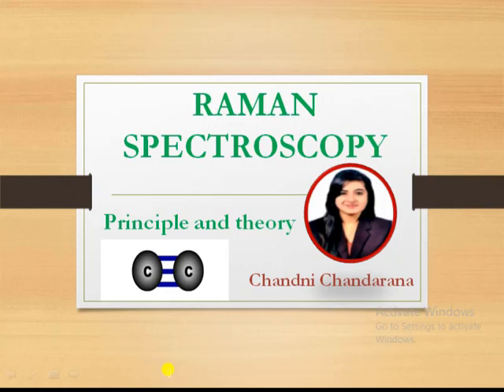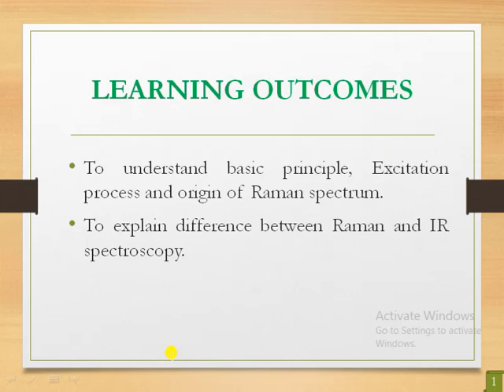Today we will discuss a very interesting topic, principle and theory of Raman spectroscopy. So these are the learning outcomes. After attending this video session, you will be able to understand the basic principle, excitation process and origin of Raman spectrum, as well as explain the difference between Raman and IR spectroscopy. Now we will see in detail.